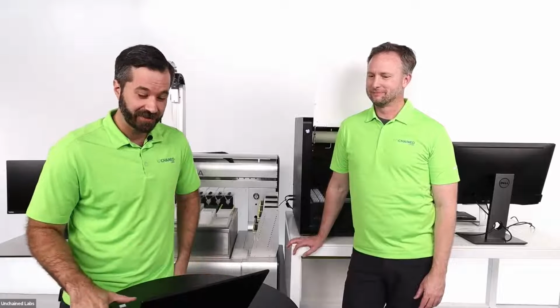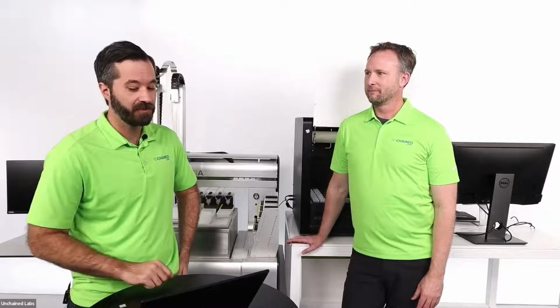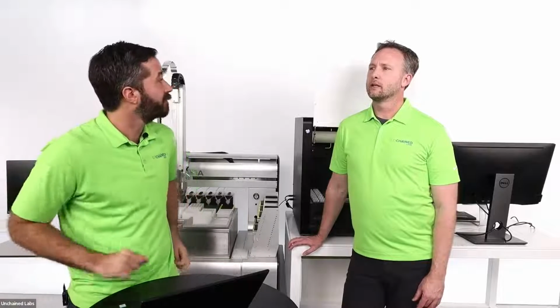And then one last question that I think is actually interesting. Maybe we can talk about that sometime later. Can you set up a run to get to a specific concentration? So could a user put into the software, I've got a concentration of 1 mg per mL, I want it to end at 10 mg per mL?